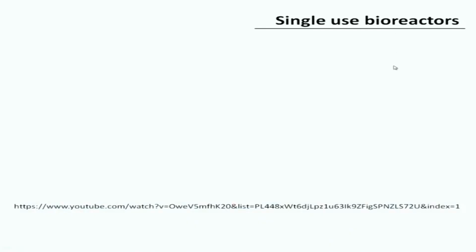This has significant advantages in the process of validation, because validation is rather stringent and people need to establish various aspects in a reproducible fashion when approvals are given for production, after inspections and so on. Such operations become significantly simplified if you can use and throw the bioreactor, and therefore single use bioreactors are quite popular.